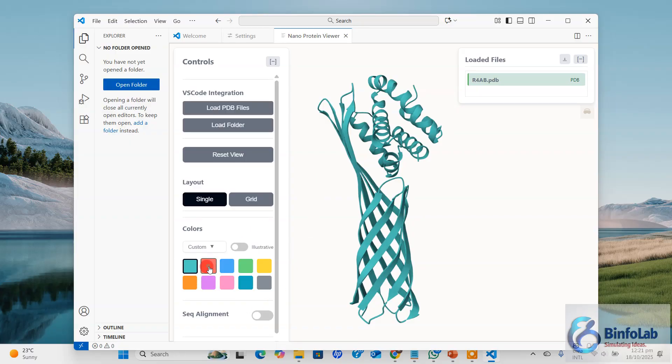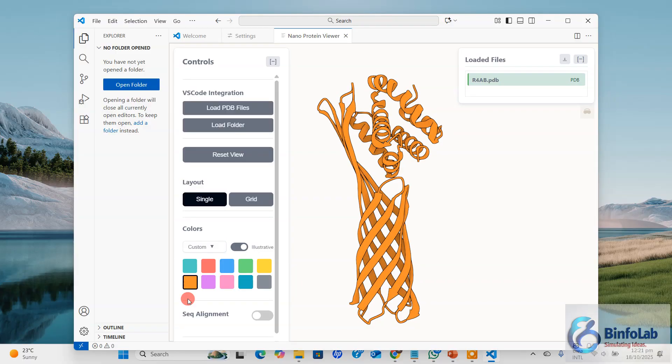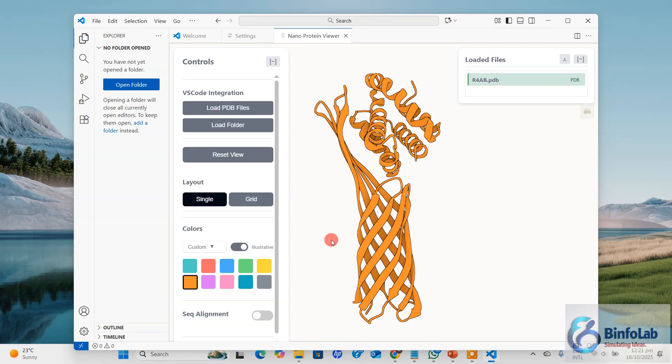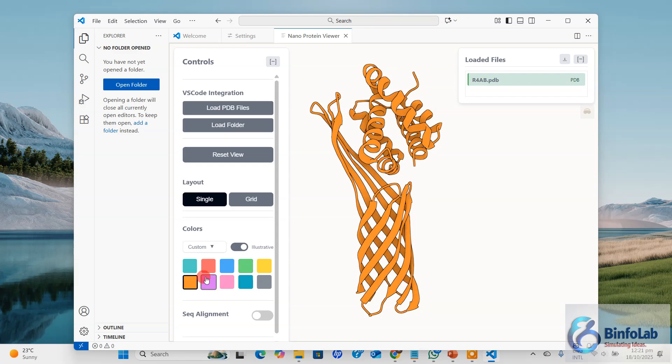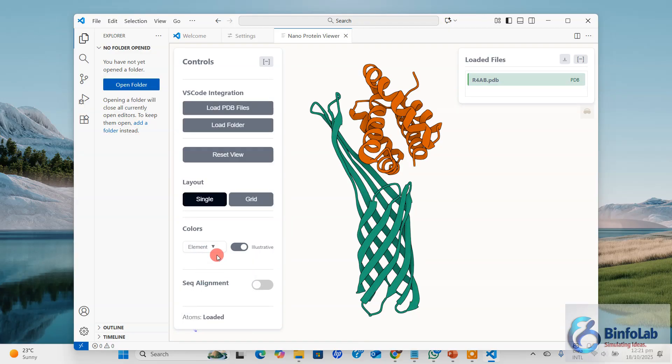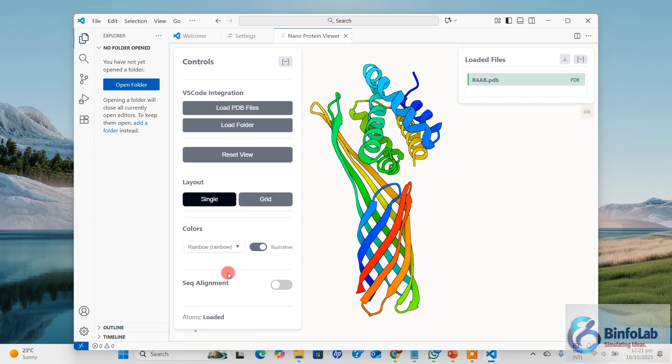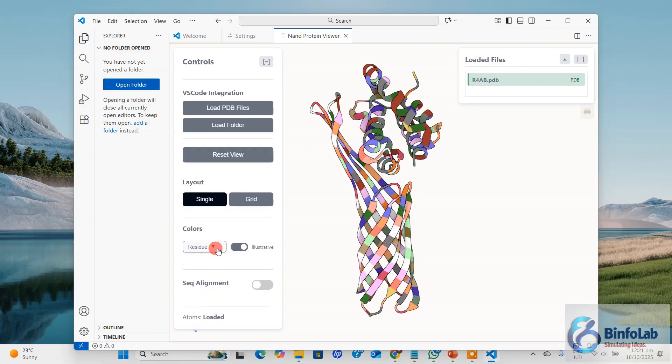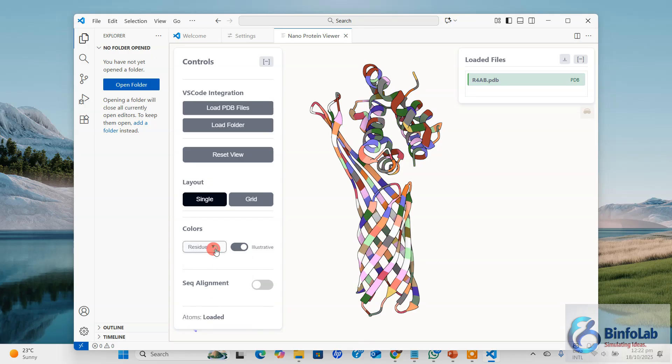This protein is actually two different chains of protein. From here you can quickly change the coloring scheme. Now if you want some more illustration, just click this one. Now you can see the visualization is more illustrative by turning on these side lines. You can try different color schemes with this.